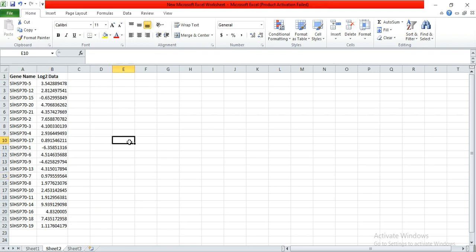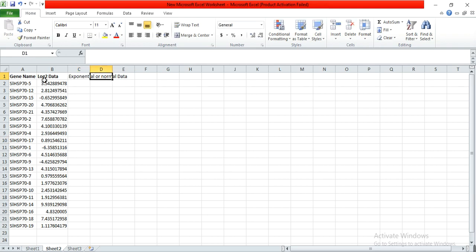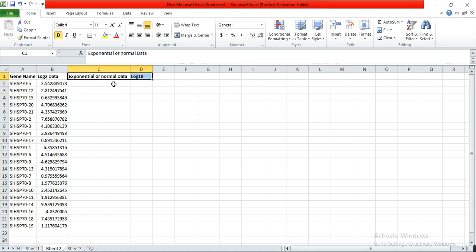Sometimes when we do RNA-seq analysis, companies give us data already in log2 form. So how do you convert that into another log form, for example log10 or log5? First you must convert this log data back into normal or exponential form, and then you can convert it into the desired log form. For example, I have received expression data in log2 form and want to convert it into log10.